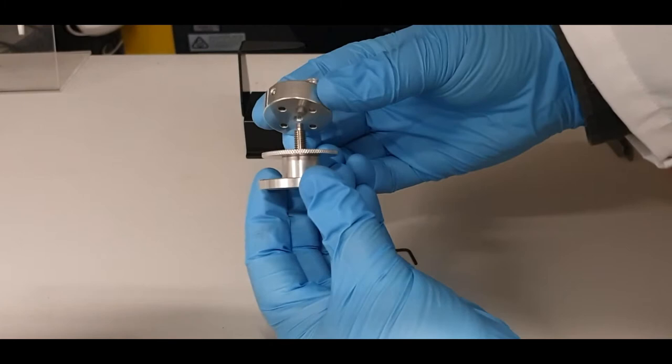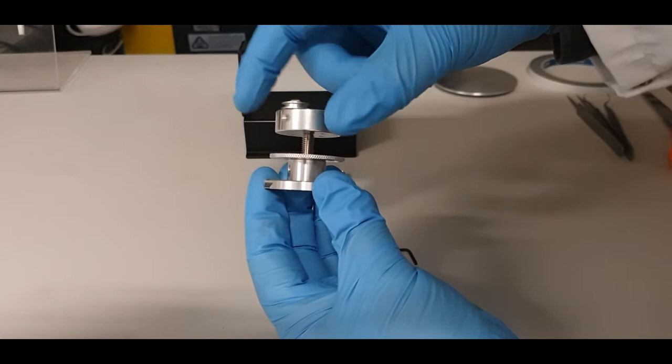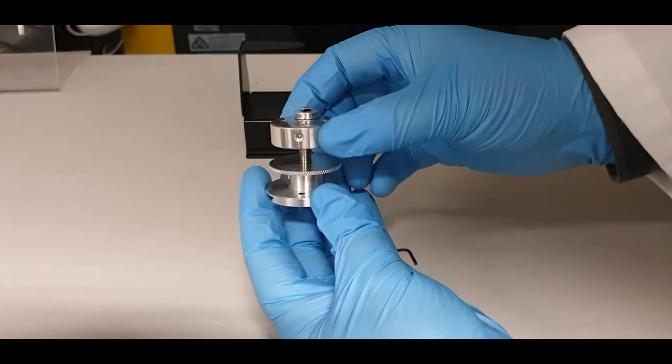Take the pin stub holder, make sure that the threads align — it's quite delicate to get it to engage, but once it's engaged, rotate it gently until you feel it contact. Do not use force; just gently finger tight such that it will not rotate on the post.